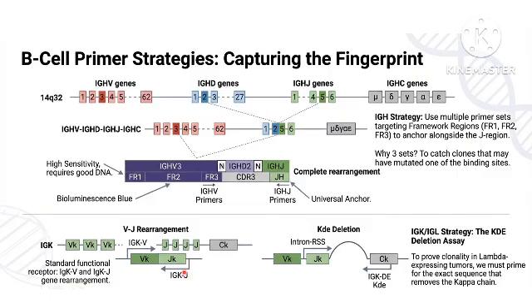Until now this is looking good. If you design two primers, this is a very straightforward thing, you don't have much complexity here, so you can get your amplification very easily. Successful amplification can happen without allele dropout, etc. But the problem comes when you don't have IG kappa also, because as you know, the majority of B cells express kappa, but around 30 to 40% of B cells express lambda. So whenever there is no kappa rearrangement, the cell has to undergo lambda rearrangement to survive.